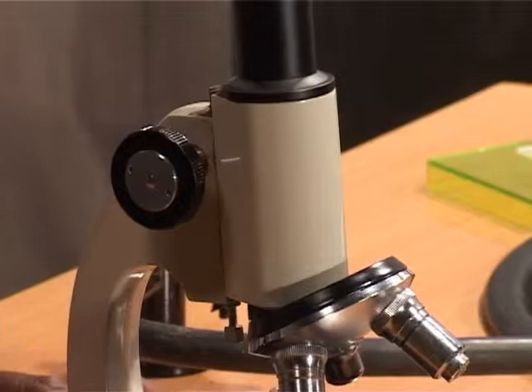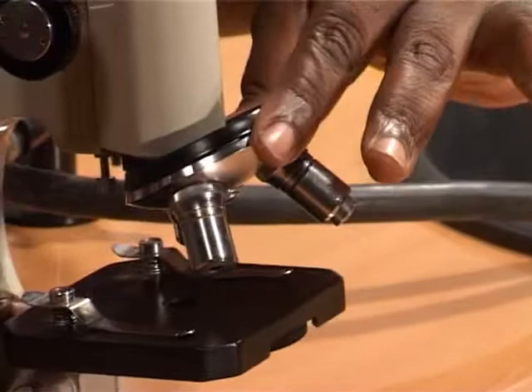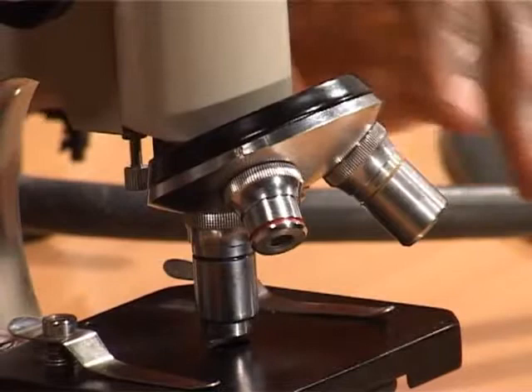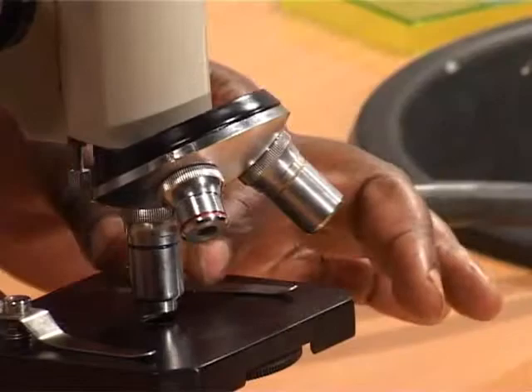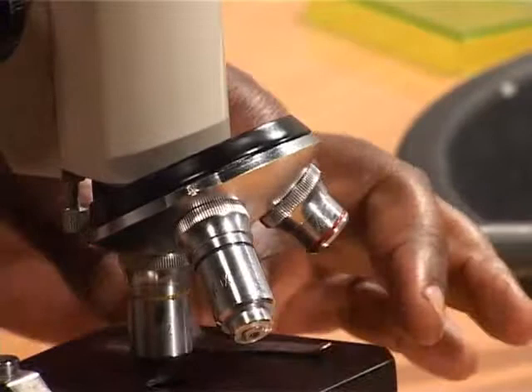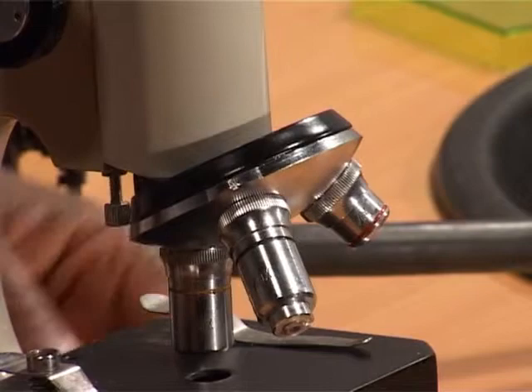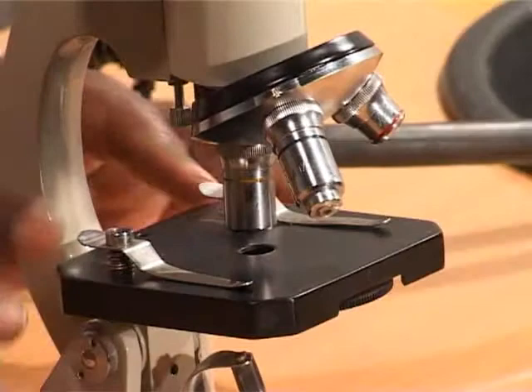Now let us move to another part. We have this part, which we can use to turn. We call it the turret. This part which is rotating, we call it the turret. Now we have these parts. There are three if we rotate them like that. These we call objective lenses. We have this part here, this black, the whole thing here. This part is what we call a stage.